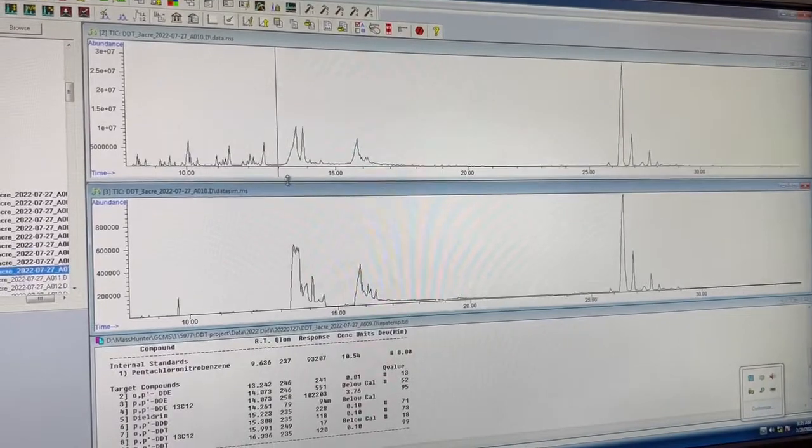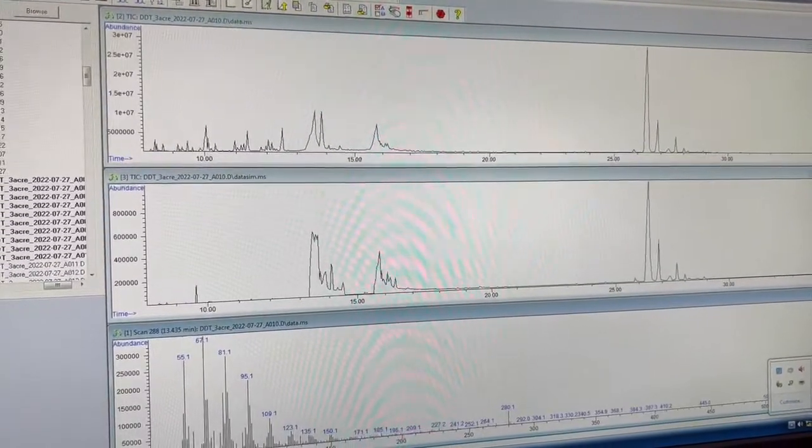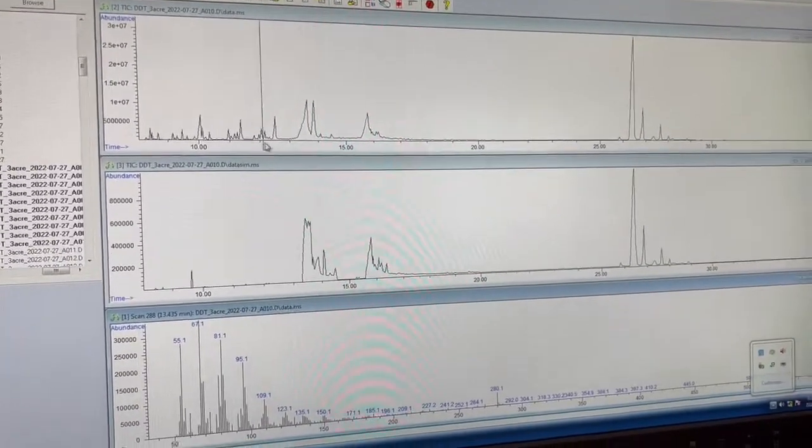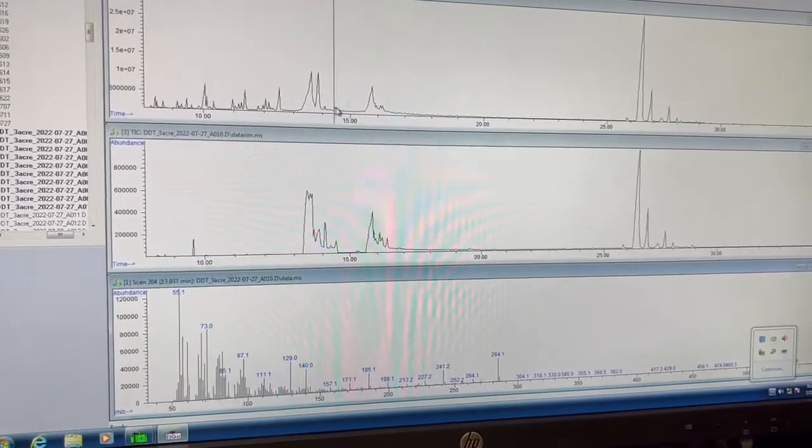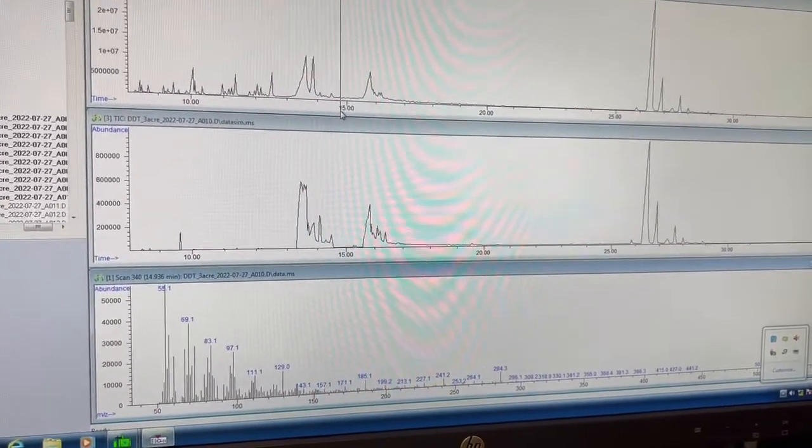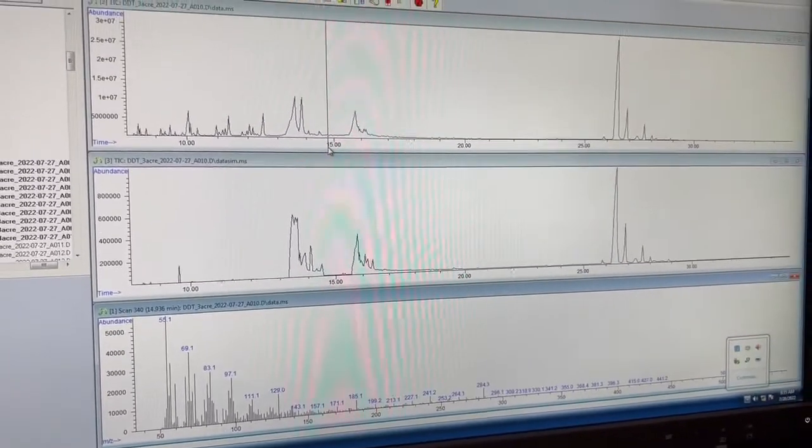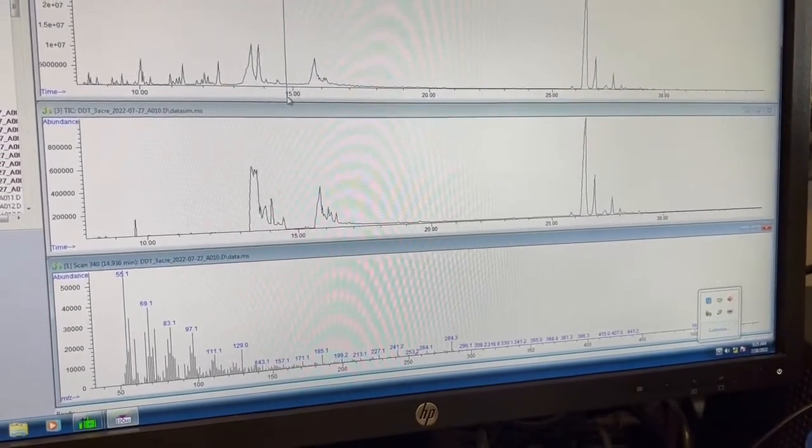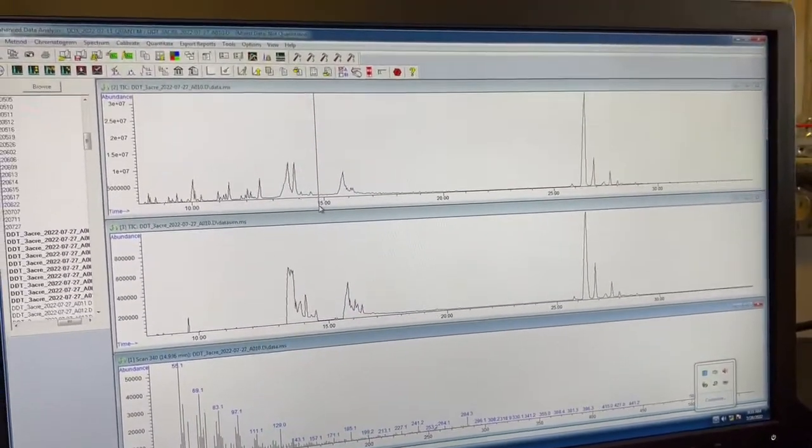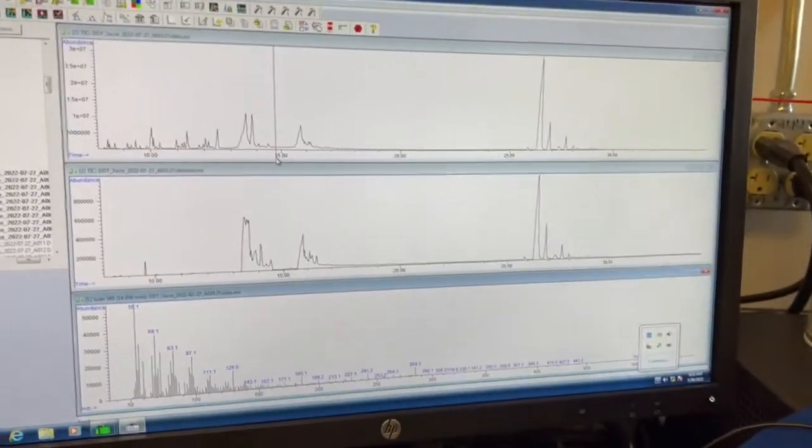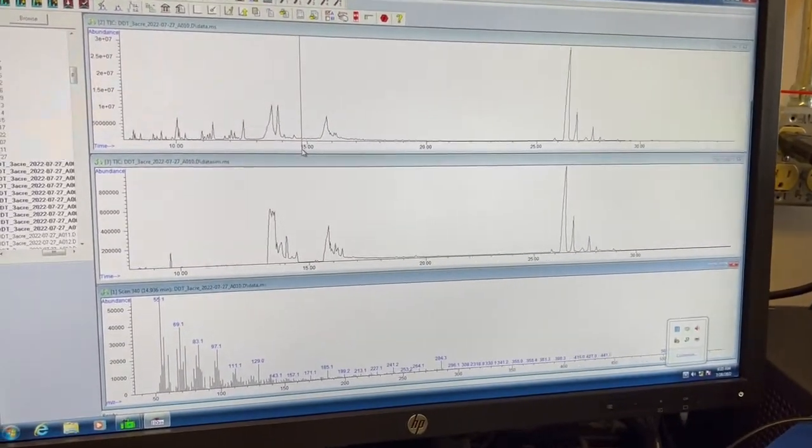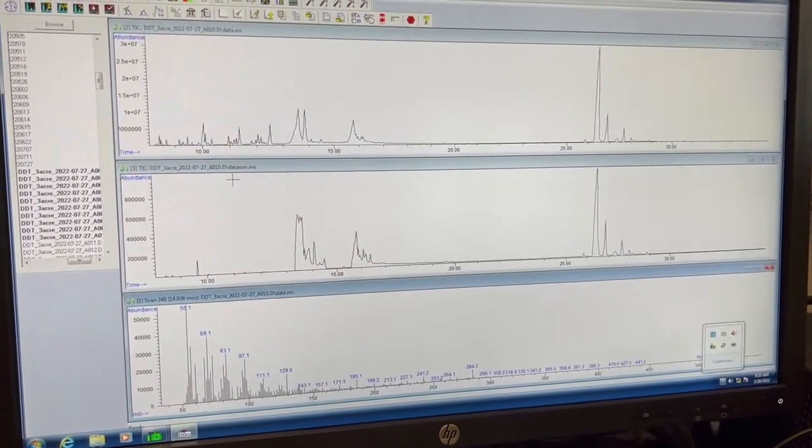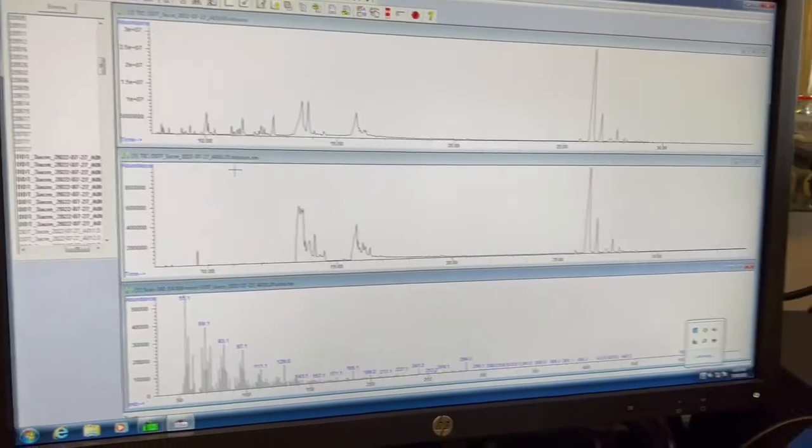And the scan, what it does is it will look for all ions present at any time. So you can left click here and you can see there's so many ions. Like a ton, too many. But the thing is when it's looking for all these ions, it can't look at any of them in a lot of depth. Your abundances are going to be smaller. Your peaks aren't going to be quite as clean.